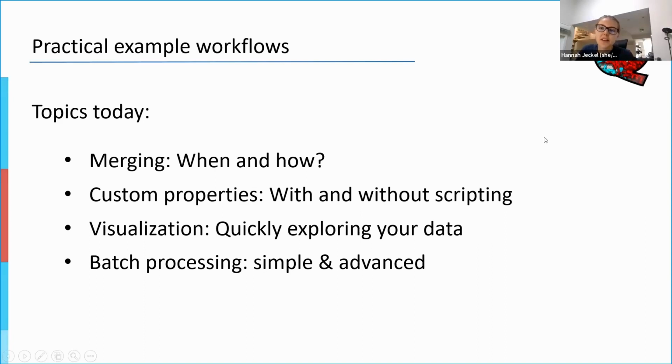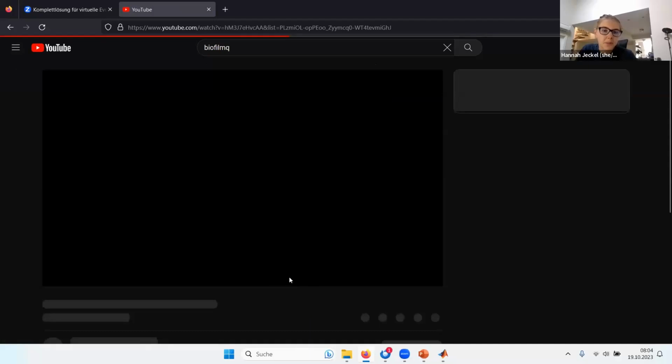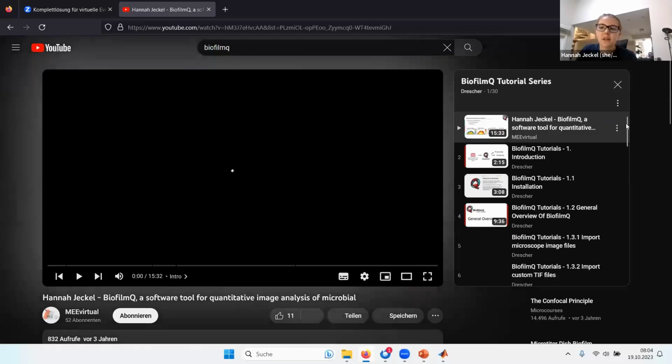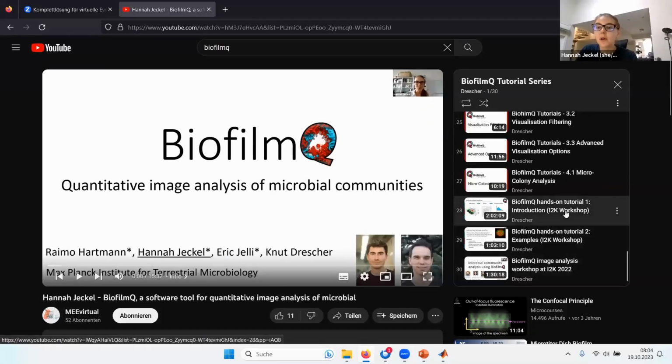So do you see the Firefox screen right now? Or do you still see this presentation? Okay, Eva's nodding. So if you just type BiofilmQ into YouTube, you will find that we have this tutorial series here, which is probably the best place to start. And it's basically just a summary of a lot of tutorials that we have. It starts with a presentation that I gave a while ago. And then all the way at the end, what you can find is recordings of previous workshops. And you can see we have the I2K, this is 2020, 2022 from last year. And then today's workshop is also going to go on there.